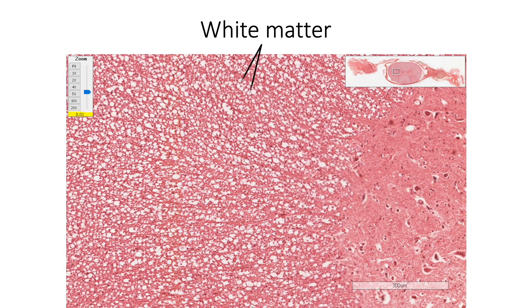Here we are seeing the peripheral white matter showing sections of variably myelinated axons of both ascending and descending tracts, interspersed with nuclei of neuroglial cells.